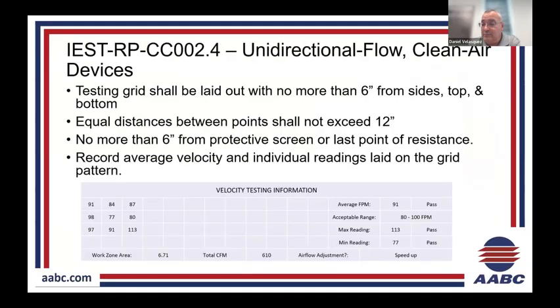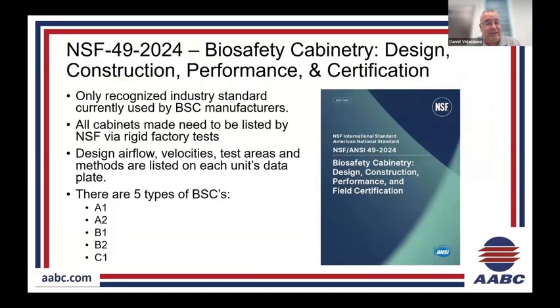So last but not least, as far as the standards I wanted to review go, is NSF 49, biosafety cabinetry.